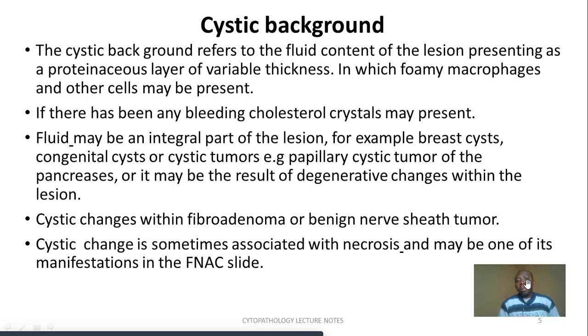Actually, before we move forward with this, the moment you see a big number of foamy macrophages in the background, this is an indication pointing to the fact that the slide background you're looking at could be cystic.